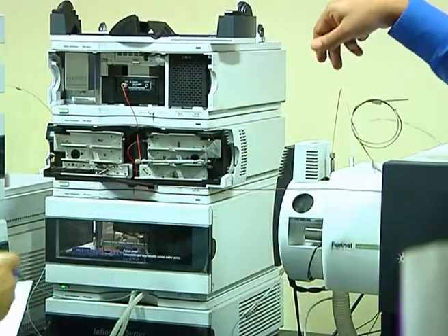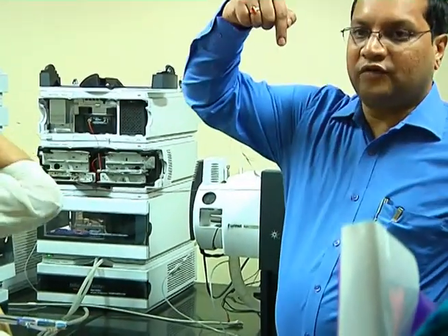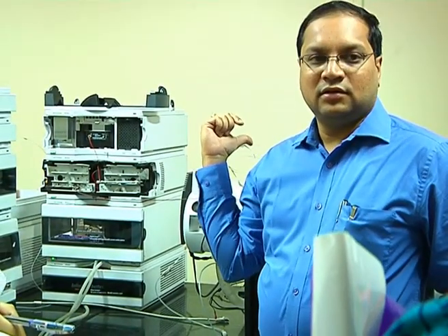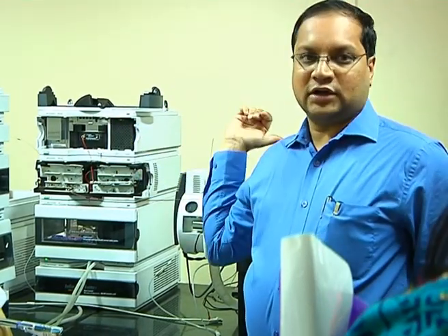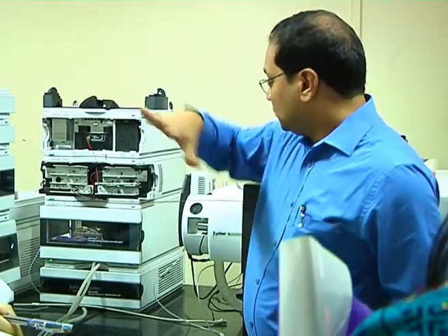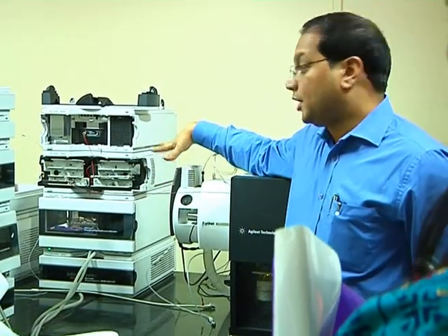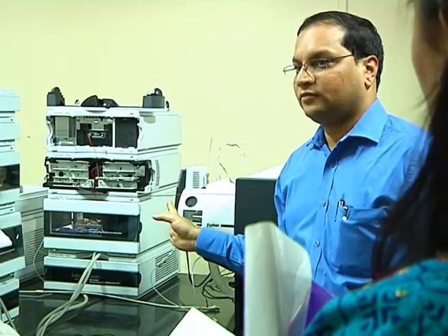So it goes in, and as you see, what is the output here? It's a stream of liquid. But what does the MS measure? Mass, ions. So the language it is talking is not understood by this right now. We need some sort of device which converts this liquid into ions. That is where the role of an interface comes, which is also called an ion source or atmospheric pressure ionization technique, and one type of atmospheric pressure ionization is electrospray ionization, which is this.